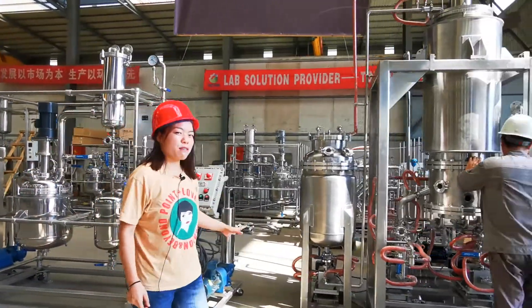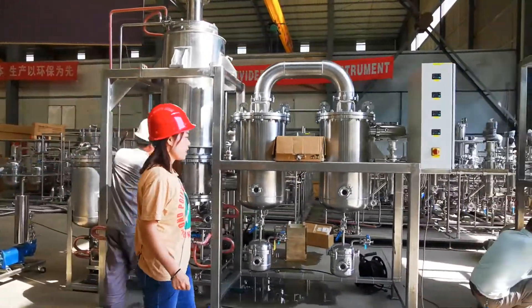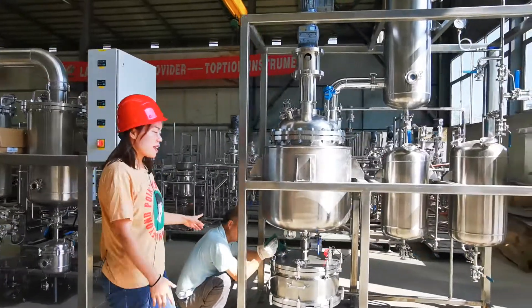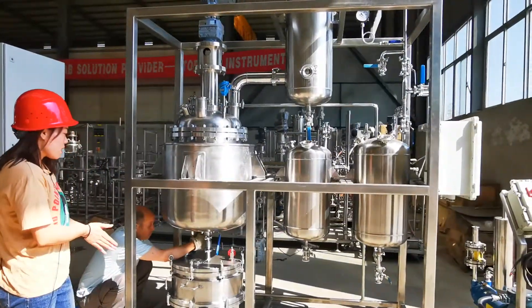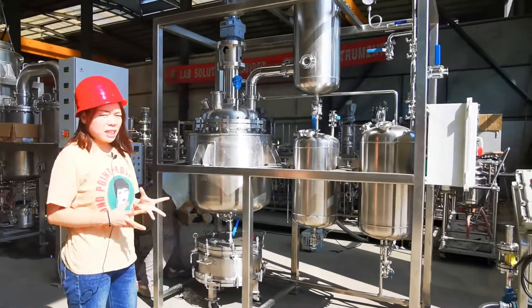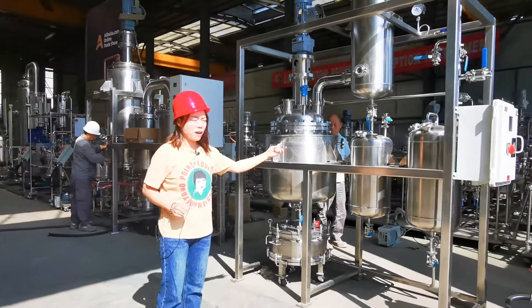This is our wiped film evaporator for distillation purposes. And the final step is the crystallization filter. You can see the bottom filter — it will be very convenient to operate, with the mother liquid recovery function.